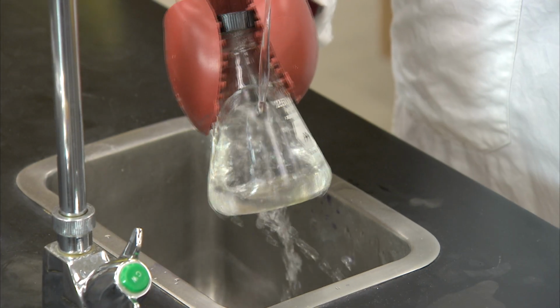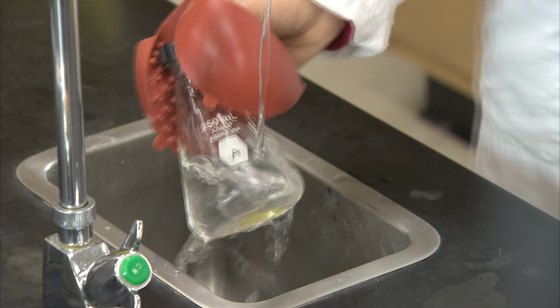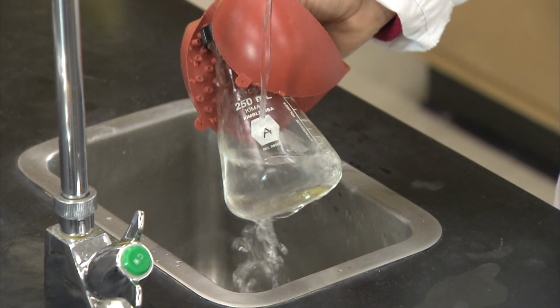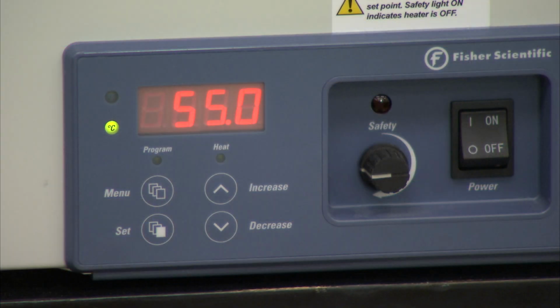The molten agarose must be cooled somewhat before it can be poured, or else it may warp the plastic of the electrophoresis unit. This can be accomplished by simply waiting, or speeding up the process by swirling the flask under running water. If you are not ready to pour the sample, the agarose can be kept in a molten state by placing it into a 55°C water bath.